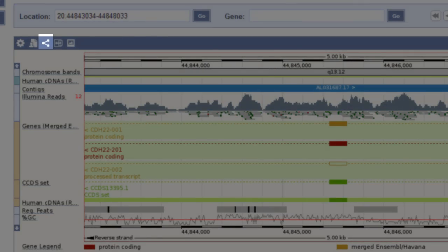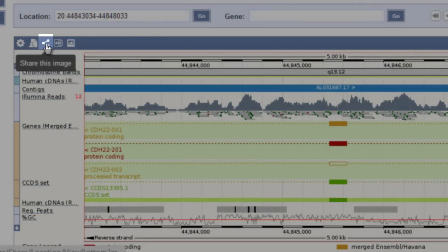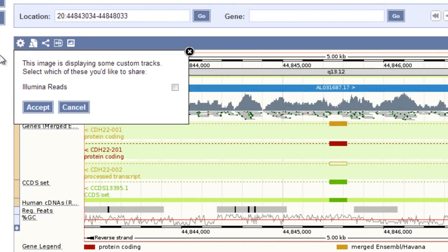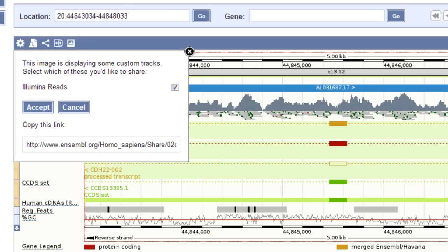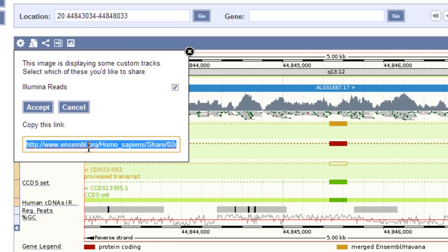If you use the share icon, it will ask whether or not you want to share your data track. It will give you a URL that you can send around. I'll select Illumina Reads to share my data with a collaborator and click Accept. It gave me a URL that I can now send around, and others can see my same view.